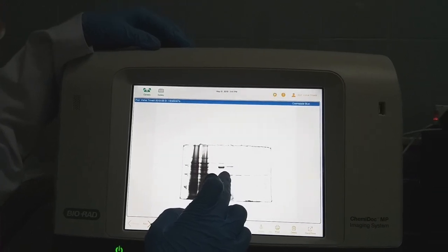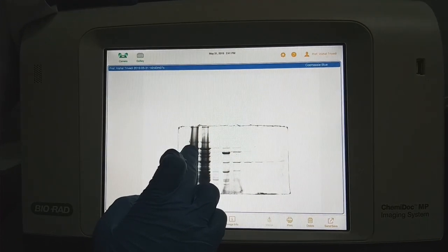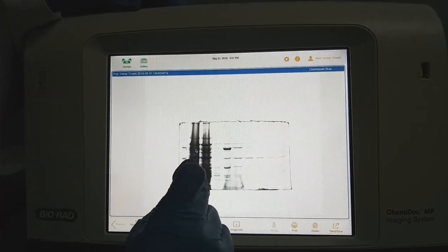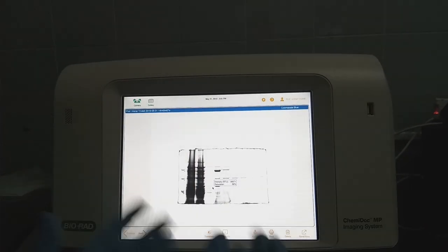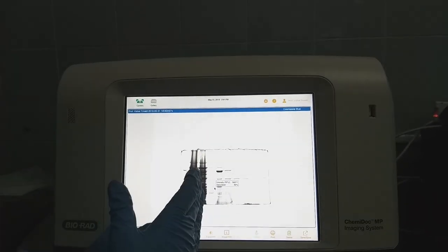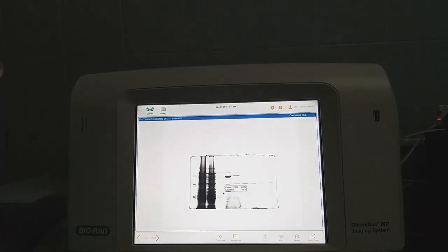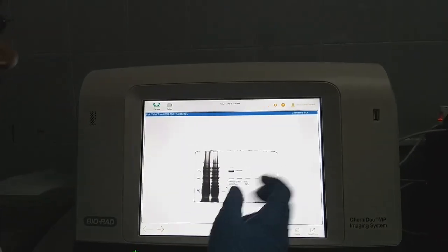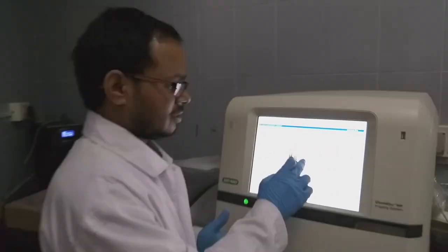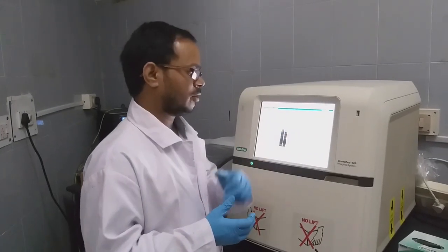As we can see, the protein corresponding to this His-tagged purification is going mostly in the flow through. So, as I said in the video earlier, we can use this flow through again for purification of the protein. You can incubate this flow through with the same beads, and you can repurify again. That will increase the productivity of getting the protein.